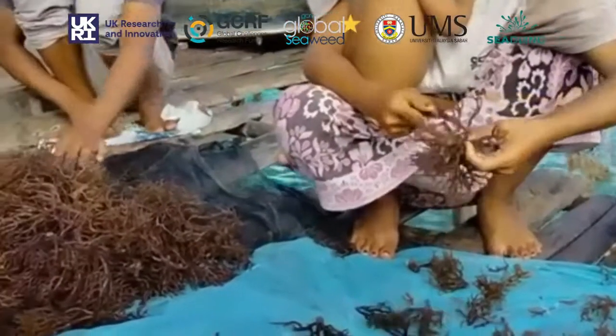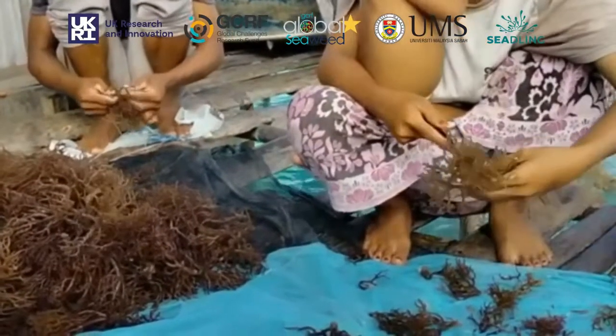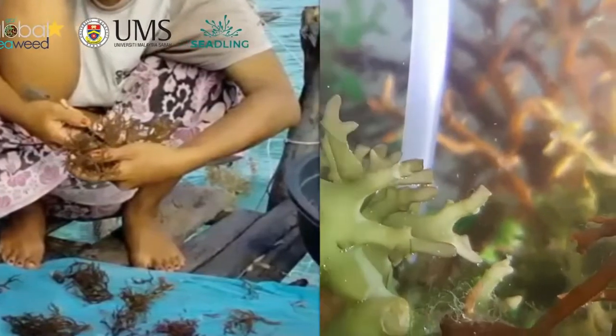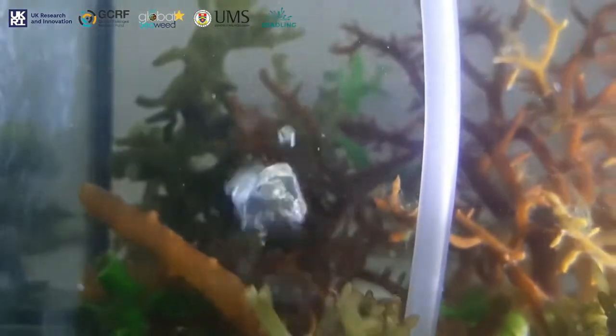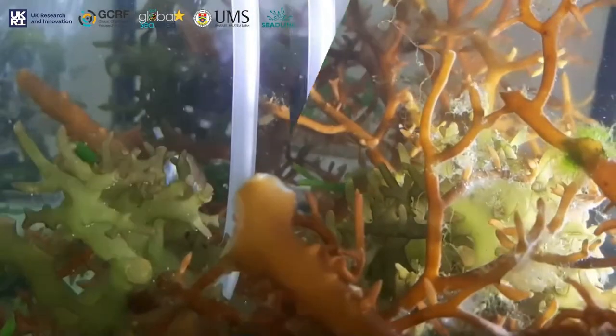University Malaysia Sabah, in collaboration with Global Seaweed Star, set forth to establish a protocol for the cultivation of seaweed germplasm in vitro using protoplast-based technology. The seaweeds were transferred into the lab where they were established in vitro.